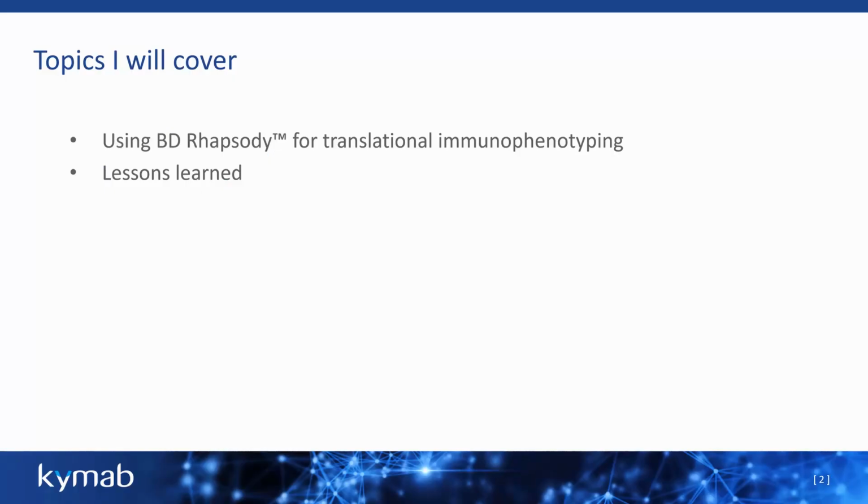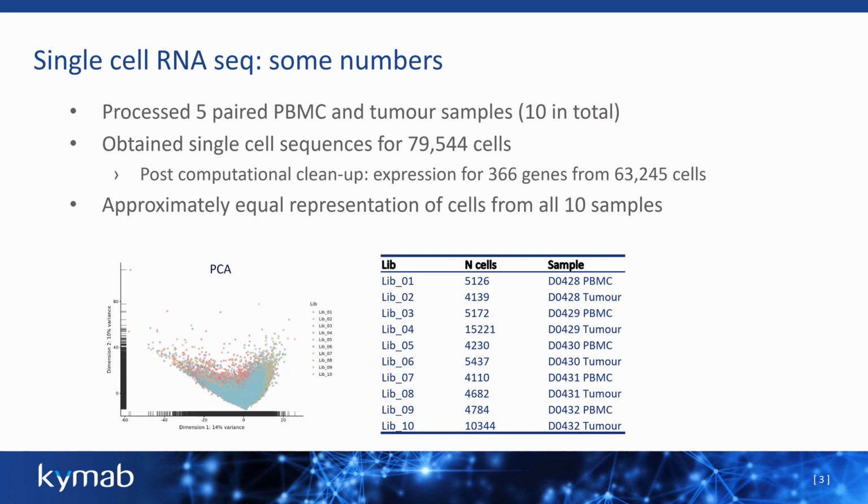In terms of the experimental part on the BD Rhapsody, we loaded a single sample per cartridge. We encapsulated them with the beads. We also used the sample multiplexing tags. Basically, it was a bit overkill, but it gave us extra information.